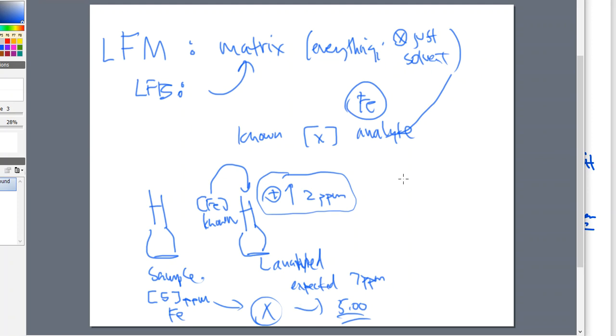All right, so a lot of people use a term here, and this term is called a spike. I am spiking the sample in order to see what my end results are going to be. Now, some labs, some methods might define spike as something different, but very often they regard this process the same way. So again, the definition is taking a sample, adding something to it, and hopefully that result goes up because you've added to it. And it's always adding the thing that you're looking for.